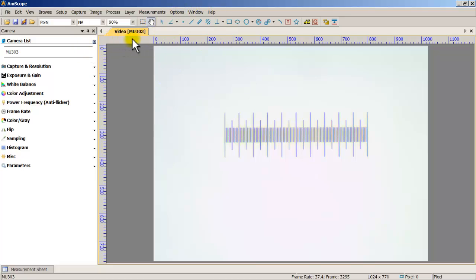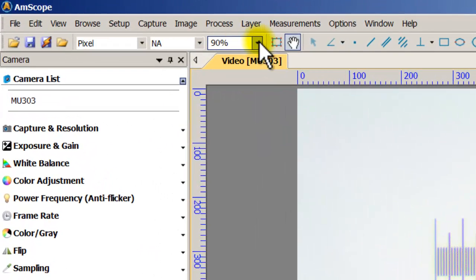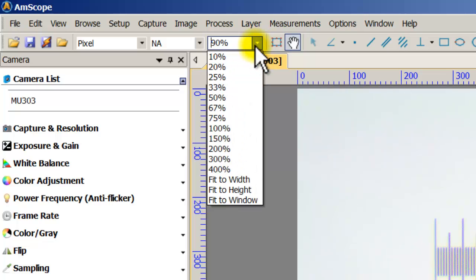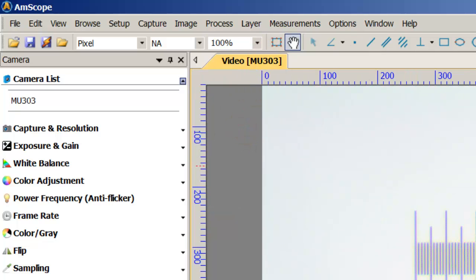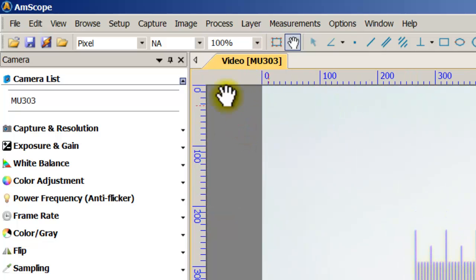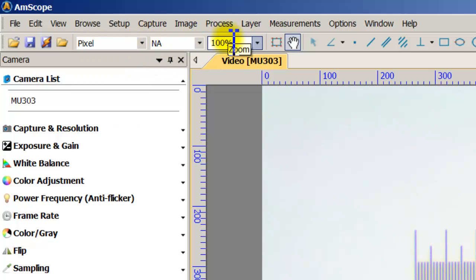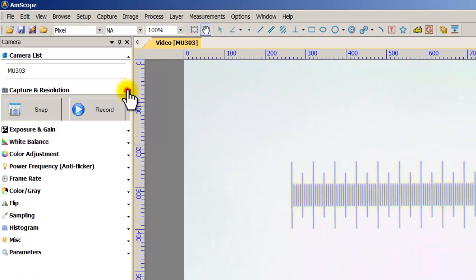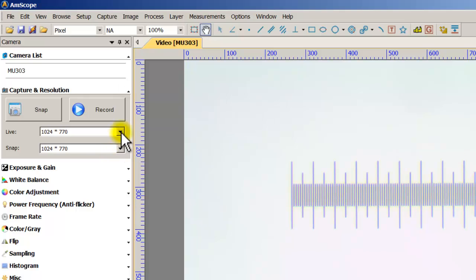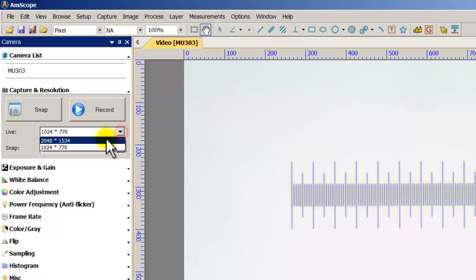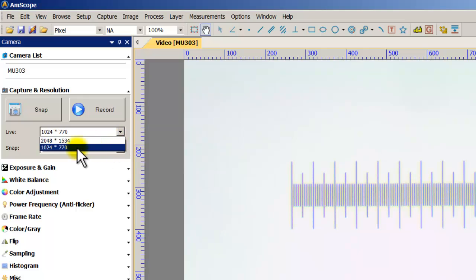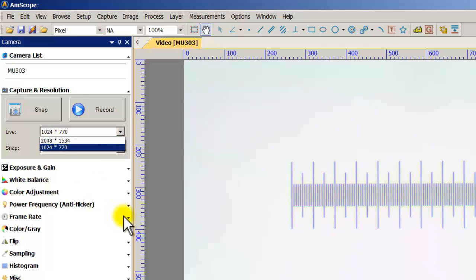To calibrate, you need to have your zoom percentage set to 100% up here right underneath the menu bar. The two other dropdown lists will be important later on. First, make sure you're at the highest resolution — don't calibrate at the lowest resolution because it won't be accurate. But before you switch the resolution, you need to adjust the frame rate.